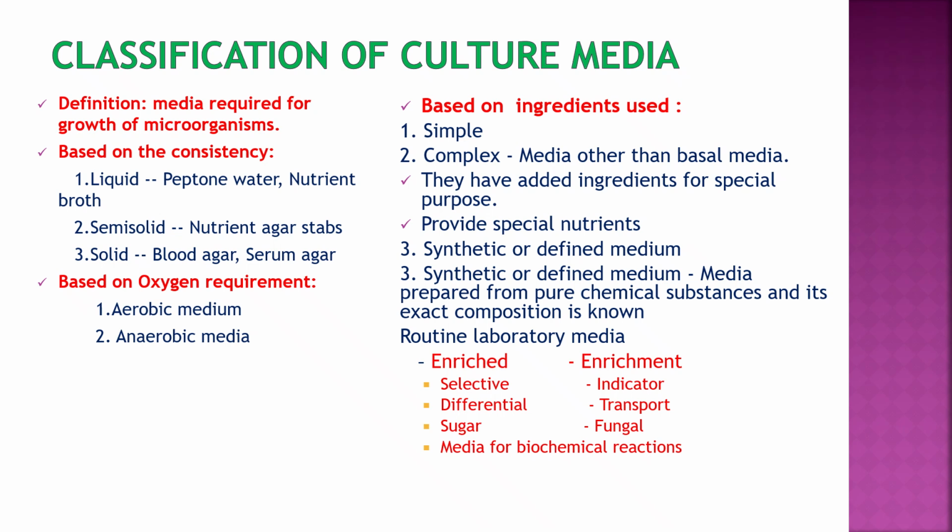First we will see the definition of culture media. Culture media is a medium required for growth of microorganisms like bacteria, viruses, fungi and parasites. But routinely we use culture media for bacteria and fungi.